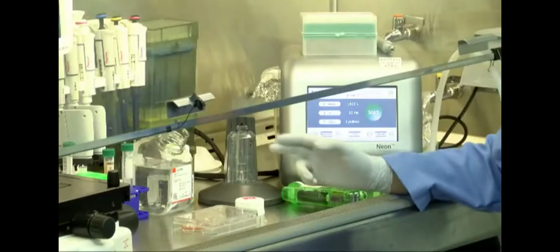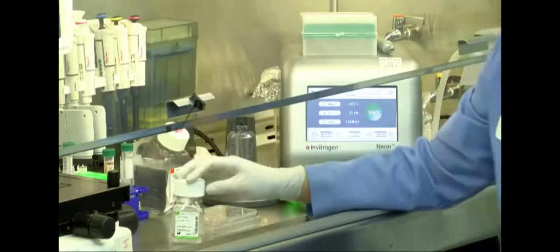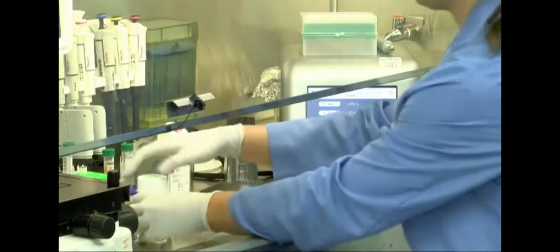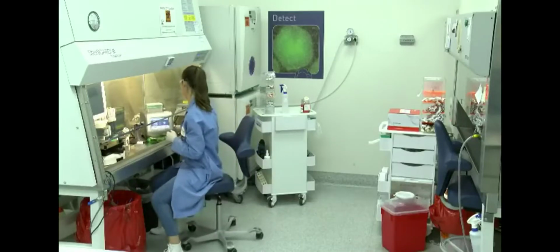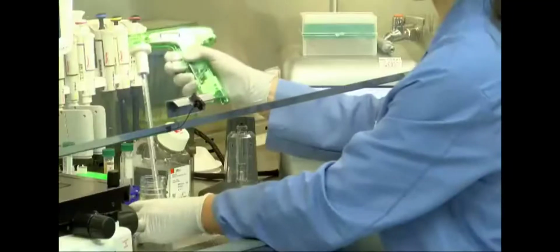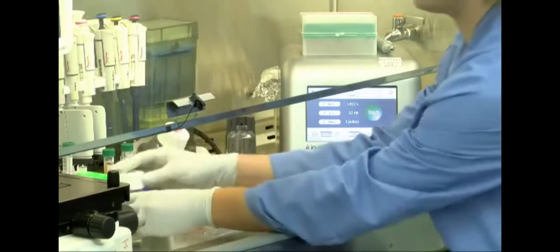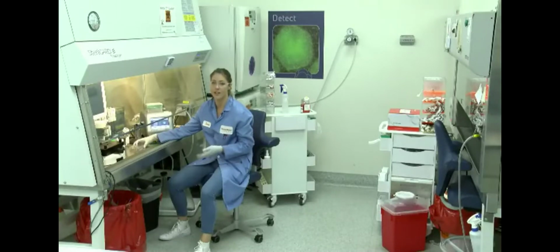Now you want to add your dissociation reagent. In this case, I'm going to be using TrypLE Express. This is a really good enzyme used for dissociating a wide variety of adherent mammalian cell types with minimal damage to your cells. For a 6-well plate, you can add about 1 ml into the dish. Once your TrypLE Express is on, you want to put your plate into an incubator at 37 degrees Celsius for about 3 to 5 minutes, and this should allow your cells to lift off of the plate.